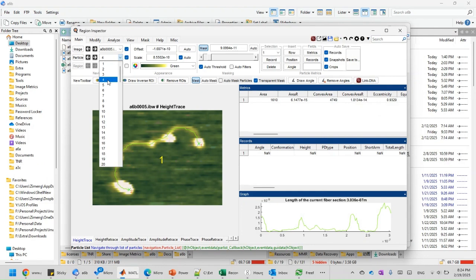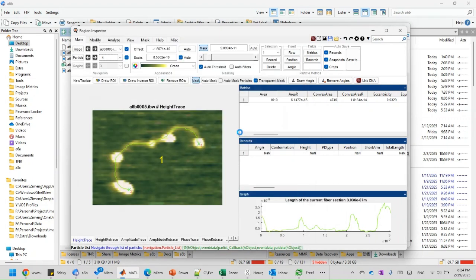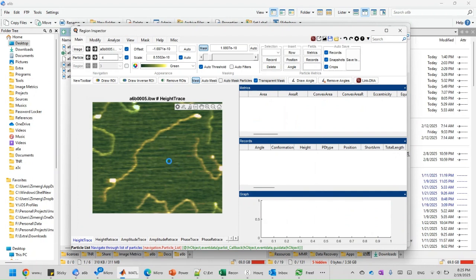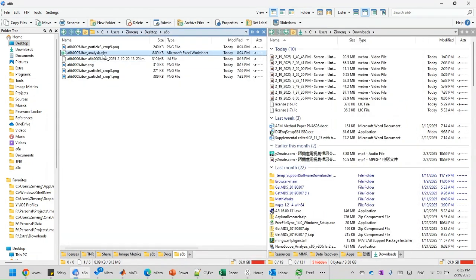Yeah, we can basically make the same mistake. Let's repeat that process. Just remember to close the Excel file. If the file is open, you cannot write to it for some reason, but that's the reality. So now we have saved this to the file.